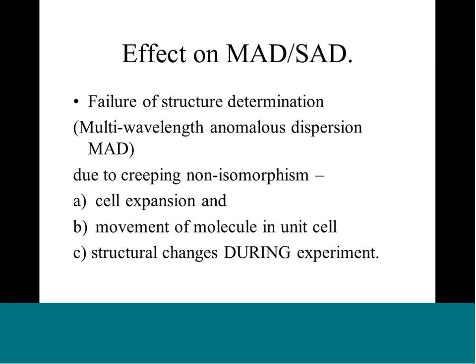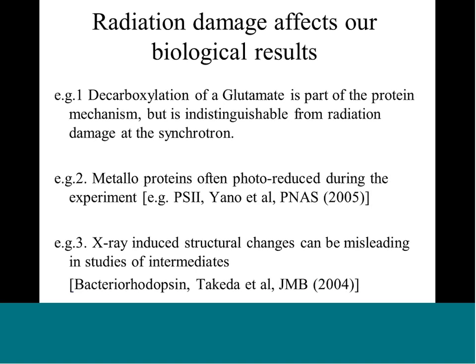The radiation damage will also possibly affect our biological results if we have a mechanism relying on an aspartate or glutamate at the active site, which will be decarboxylated by radiation damage. Metalloproteins will photo-reduce in the first few milliseconds of an experiment at 100 Kelvin. Photosystem II is a nice example of reduction of the manganese during the experiment. The Japanese group have spent many years untangling intermediates of bacteriorhodopsin to separate X-ray-induced artifacts from real structural intermediates with biological relevance.